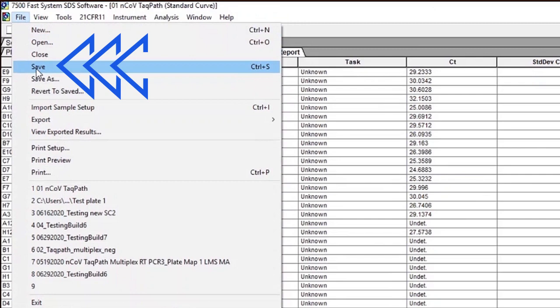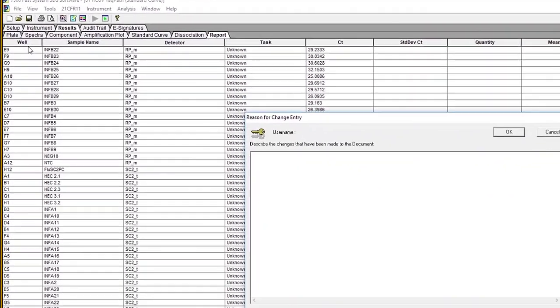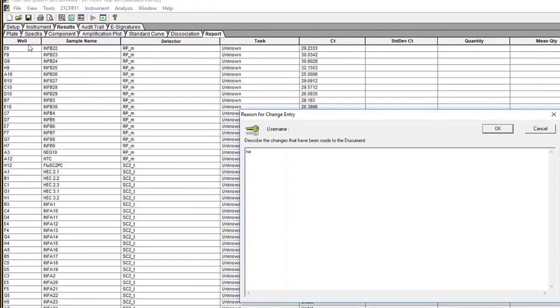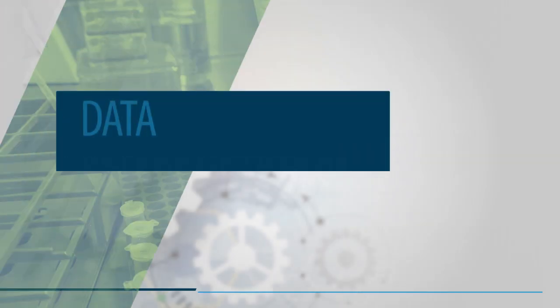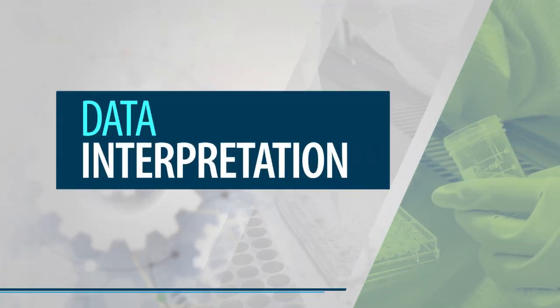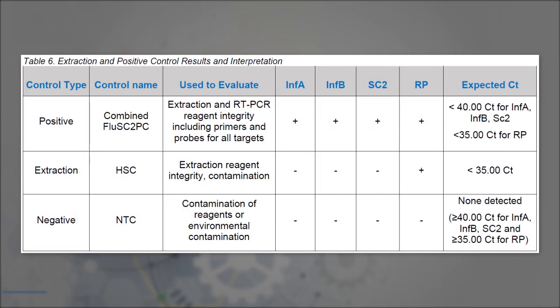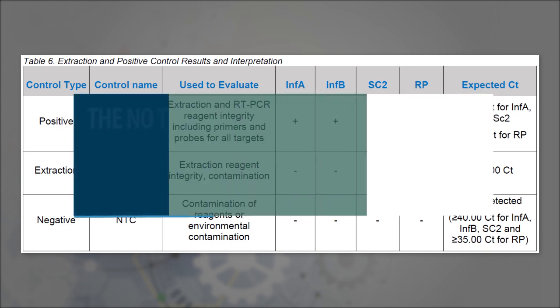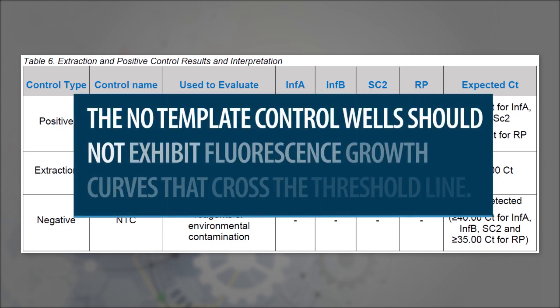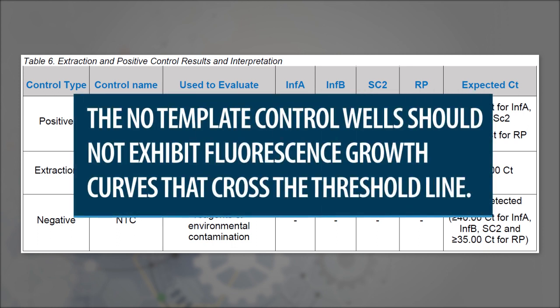Once thresholds have been set, it is time to interpret the data from the Flu SC-2 multiplex assay. Begin by reviewing data from the No-Template Control. This control reaction uses molecular-grade nuclease-free water in the real-time RT-PCR reactions instead of RNA.